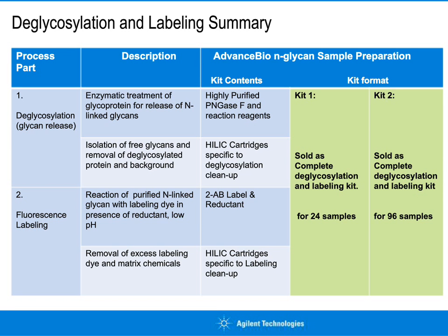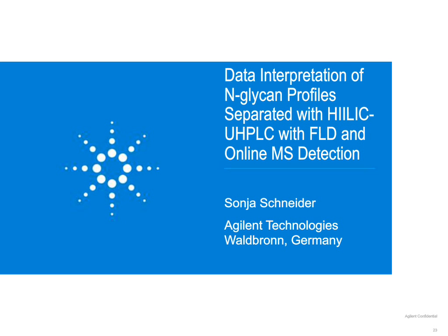I would now like to point your attention to Sonia Schneider, who is going to discuss the data interpretation portion of a labeled glycan analysis. Thanks, Jim. So welcome to my part of the talk. Today, I'm going to talk about data interpretation after fluorescence detection and online MS detection.